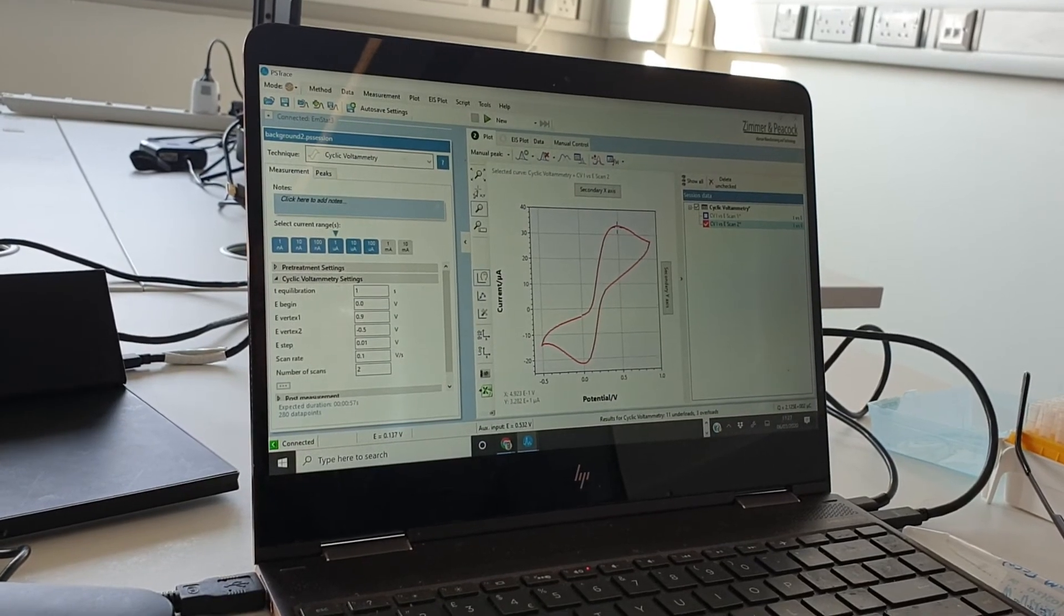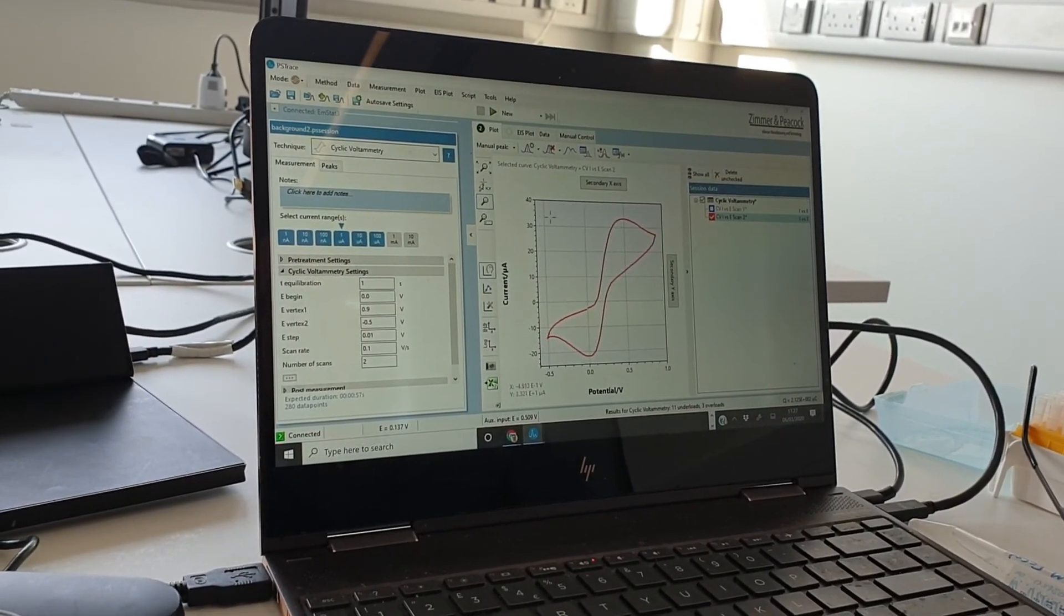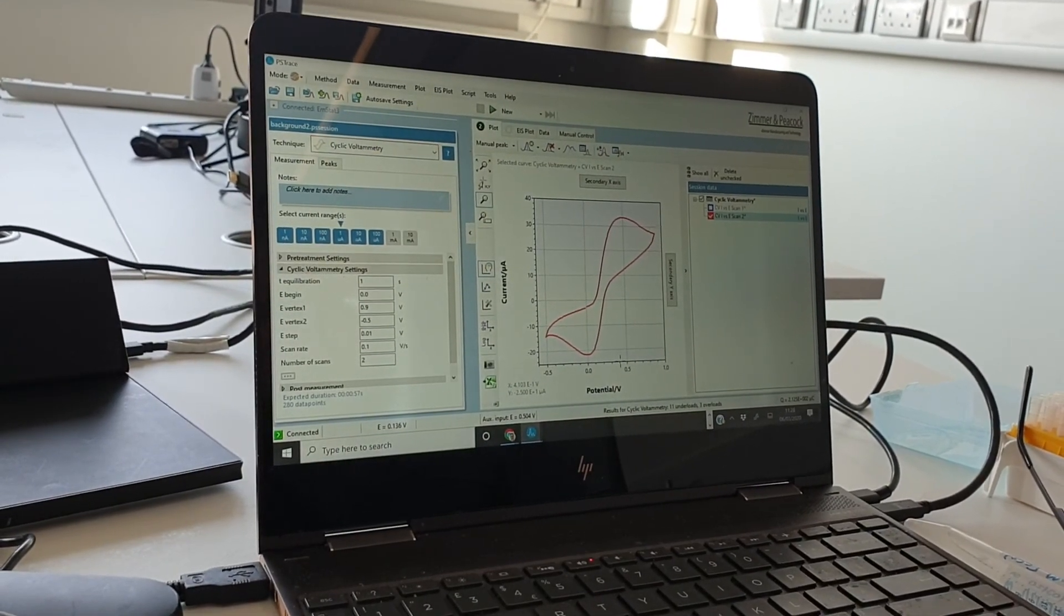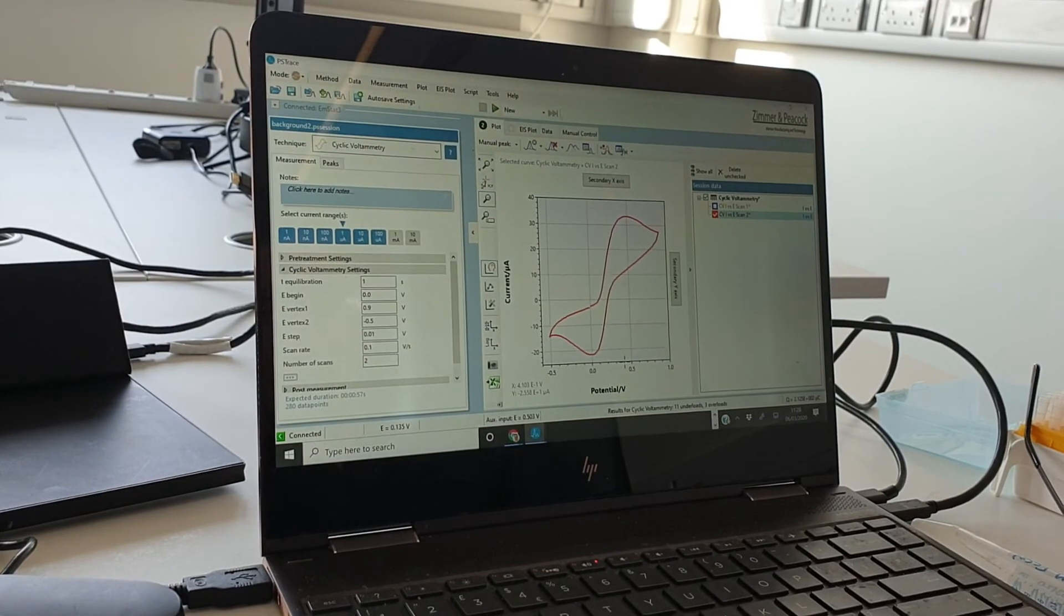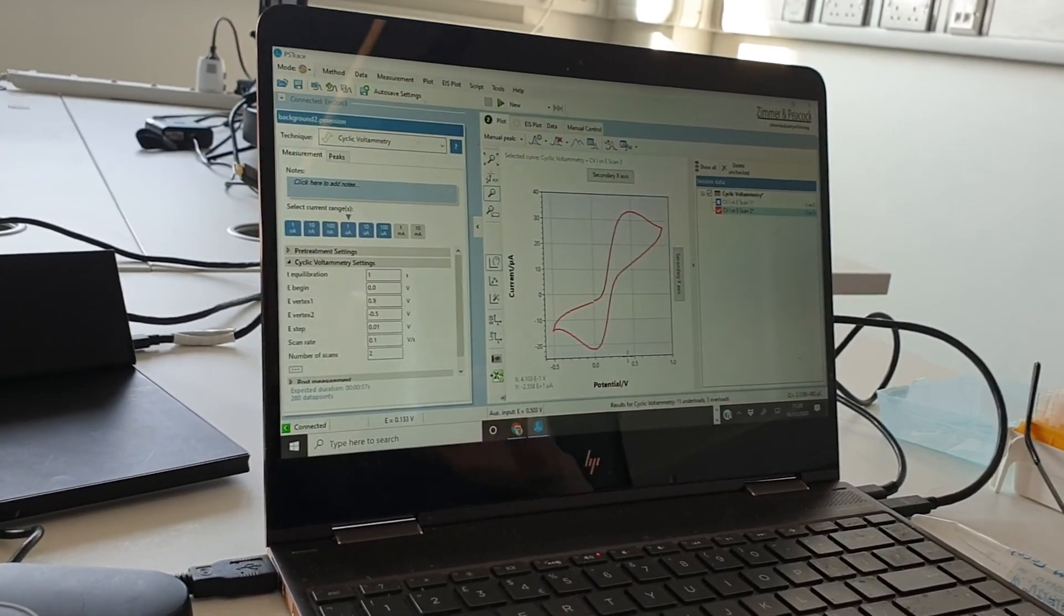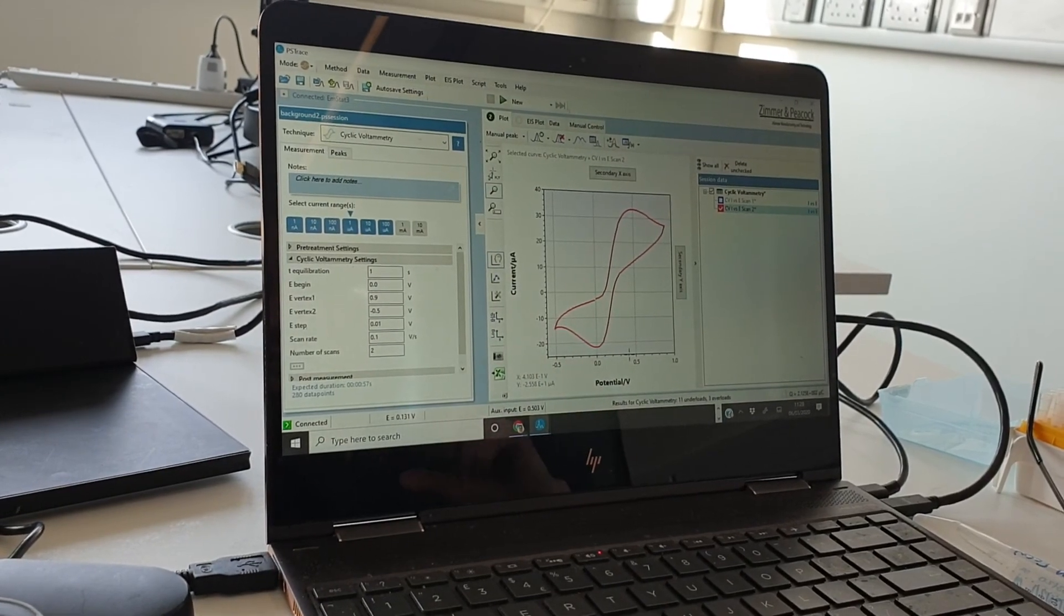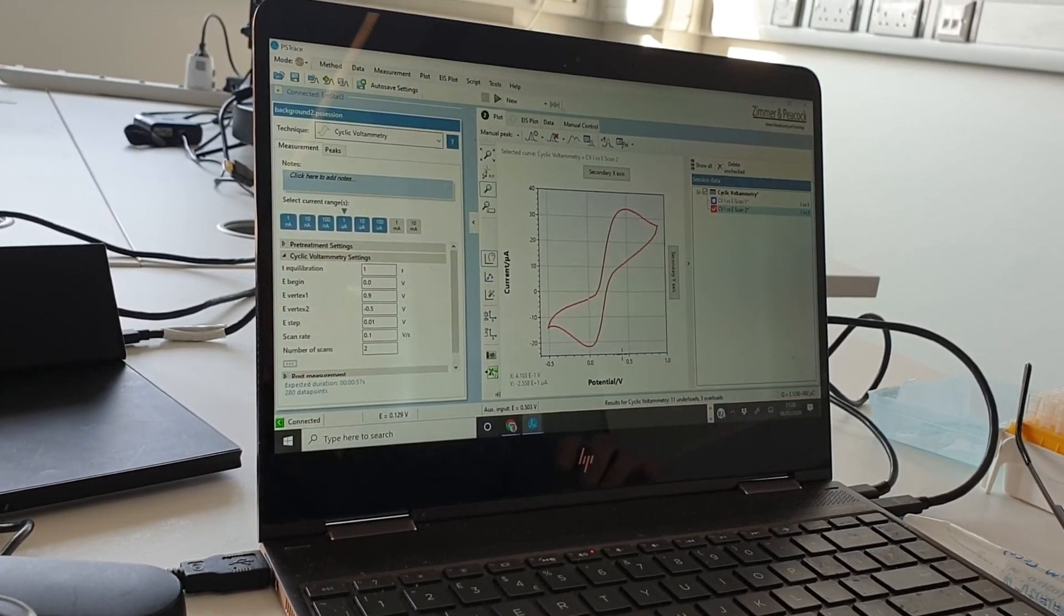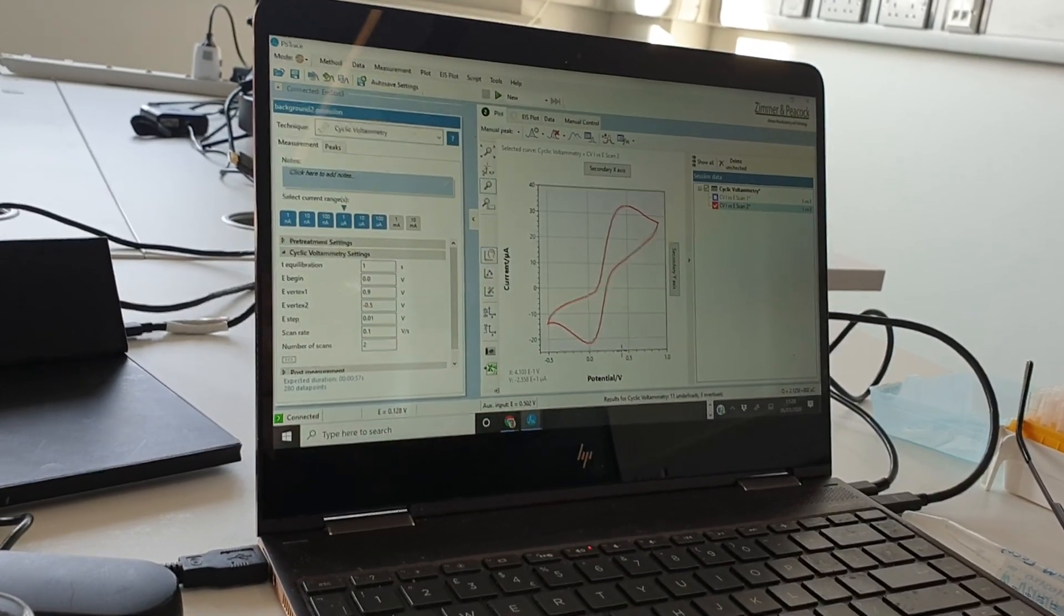So yeah, in fact when I look at the second scan then I do have that peak closer to the 33 microamps rather, and then the peak position is about 0.41 which is very similar to where we were before. So you can see a difference between the first scan and second scan. As long as you're consistent you can still rank these molecules. So just concentrate on the second scan. Okay, thanks very much.